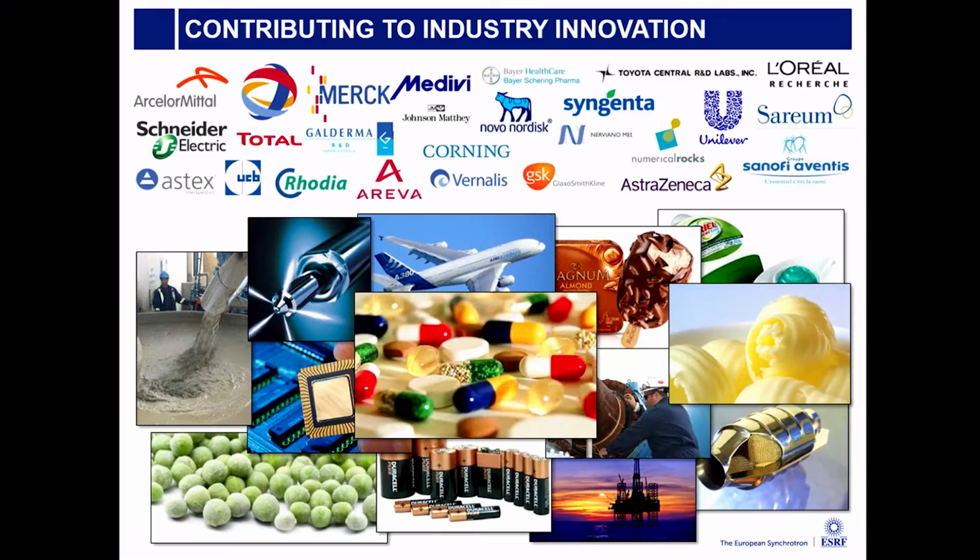It's not a Nature front cover, but this was Procter & Gamble, I think. It was Unilever, Unilever with the ice cream. And we were looking at the microstructure, trying to see how the processing could make it better. It's not a problem up here because it doesn't get that hot in the summer. But in Grenoble, where we hit maybe 35, you buy your ice cream, it melts a little bit in your car, you take it home, you put it back in the freezer, and the structure changes. So the company wanted to look at the microstructure to see how better to optimize their processing conditions to make the ice cream more stable with time and temperature.